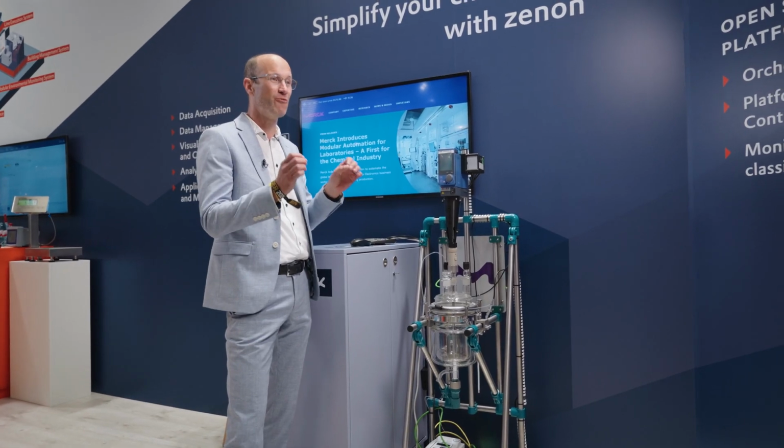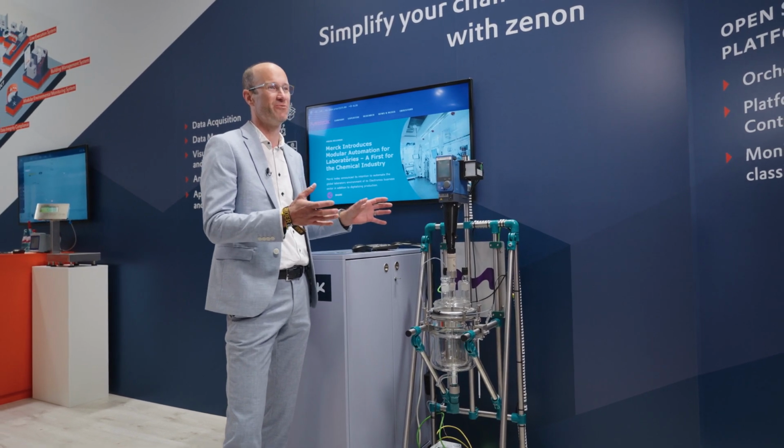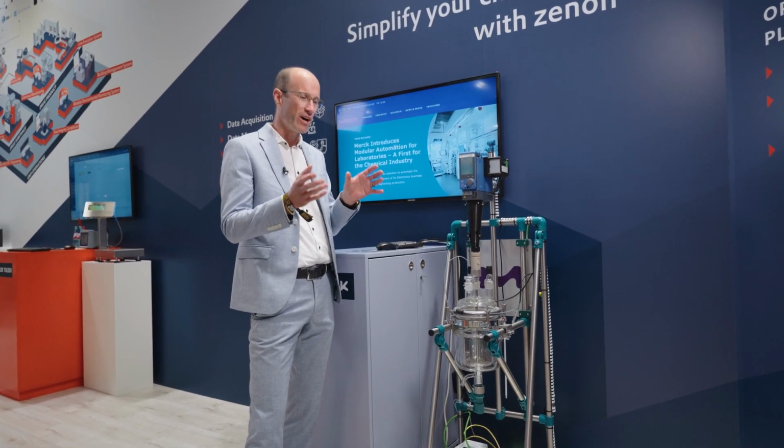Well, MTP enables you to connect everything at the end. One of the first showcases was a small kitchen machine which we connected to a system, and at the end it really explains that you can connect everything. The main thing now, and everyone knows this, is that data is the new world. And this is really one of the things which is important for us. So connectivity is one thing, to have the data available.